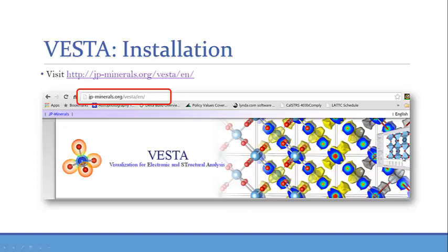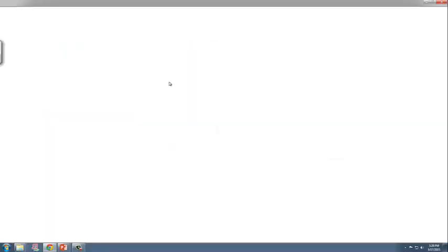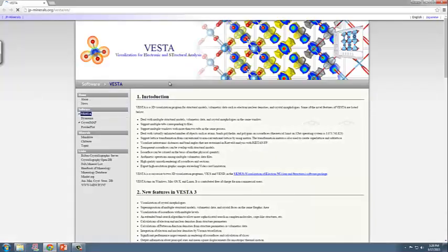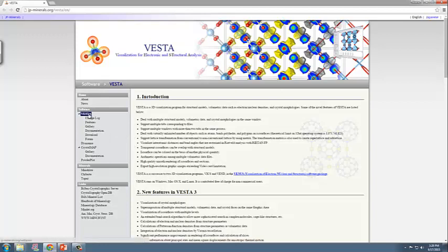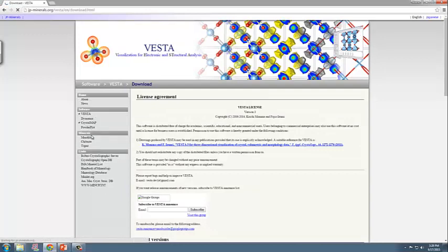So first and foremost, you need to visit the website. Here I have the link to the web page. If you click on it, it's jp-minerals.org, you'll see the main web page. What you need to focus on is on the left side here under software, go to the download link.